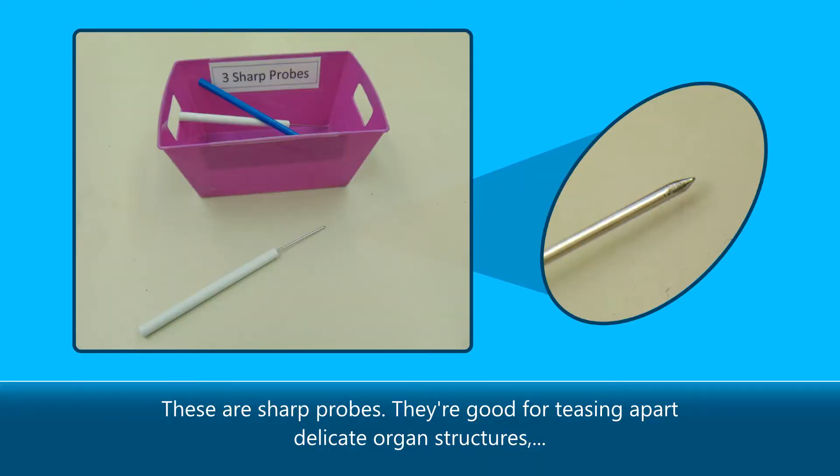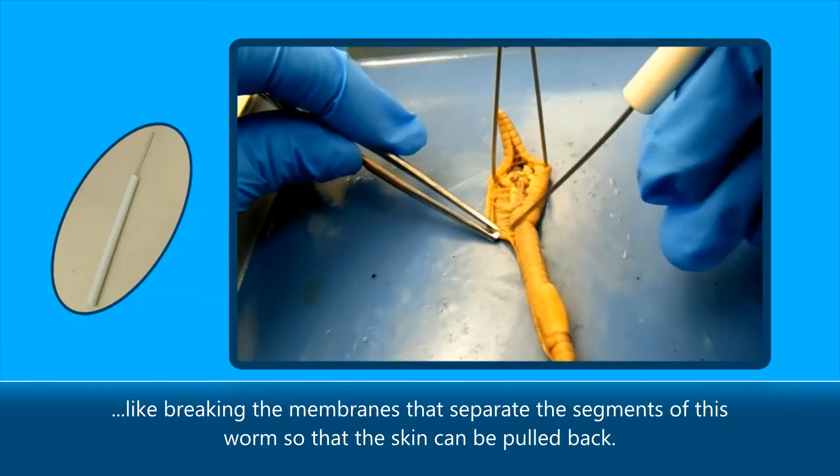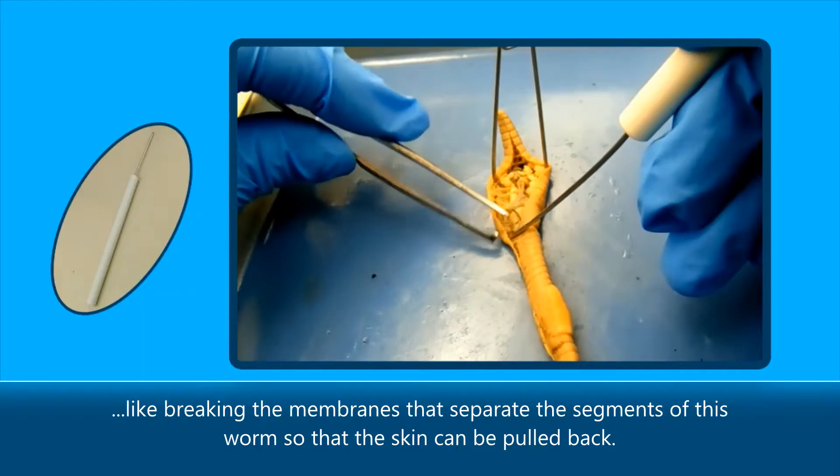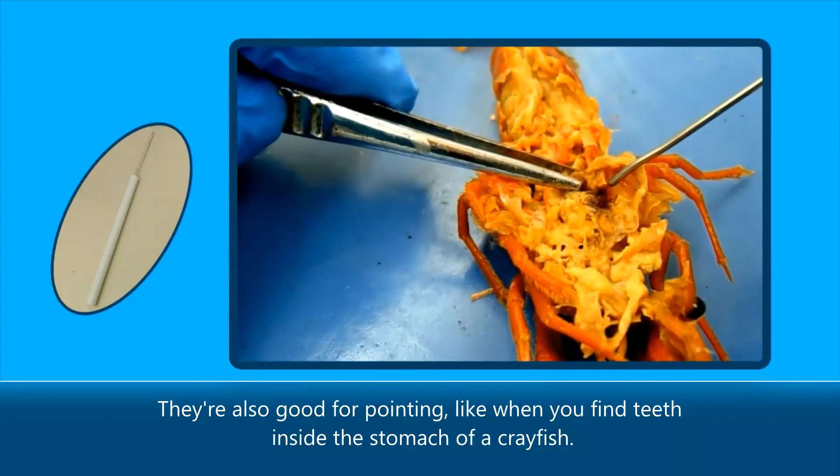These are sharp probes. They're good for teasing apart delicate organ structures, like breaking the membranes that separate the segments of this worm so that the skin can be pulled back. They're also good for pointing, like when you find teeth inside the stomach of a crayfish.